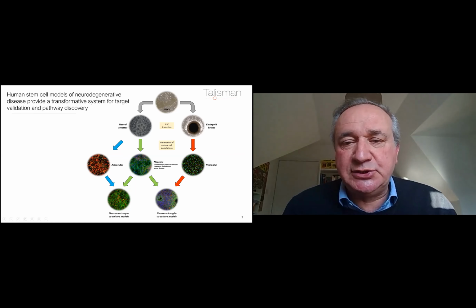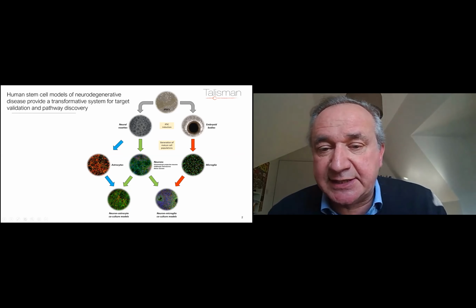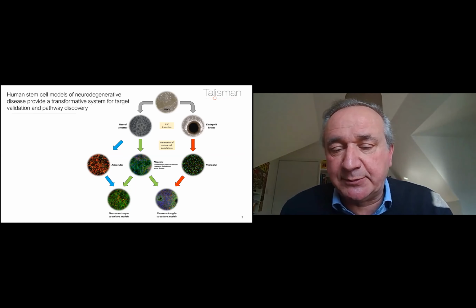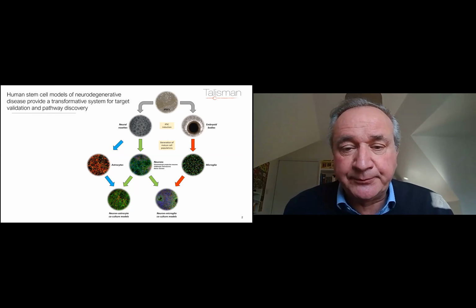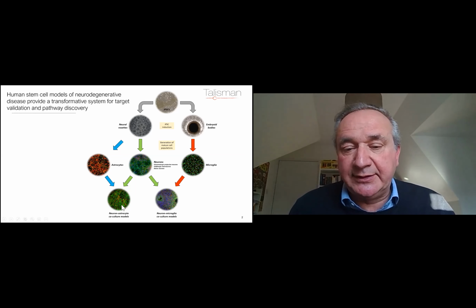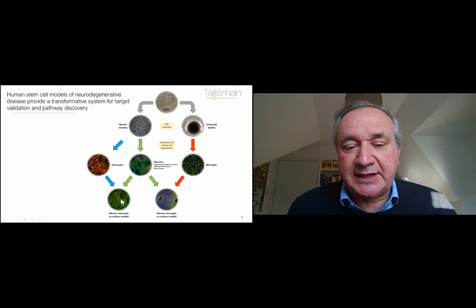The neural rosettes can be induced to make neurons, and the neurons can be of various sorts. Often, for example, they're glutamatergic, the major excitatory neurotransmitter in the brain, or can be, for example, GABAergic interneurons, which sometimes have the opposite effect, or can be motor neurons, which reach out into the periphery and connect with, say, muscle. Or they can be turned into astrocytes, and often the astrocytes and the neurons have to be co-cultured for them to survive. And so we produce neuronal astrocyte co-culture models, which don't have any microglia in them, or we can produce the microglia and then combine those with the astrocytic and neuronal cultures.